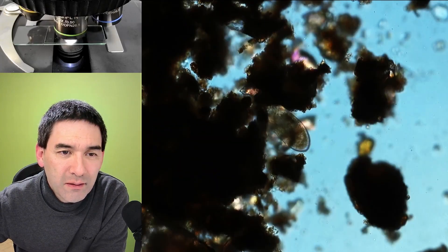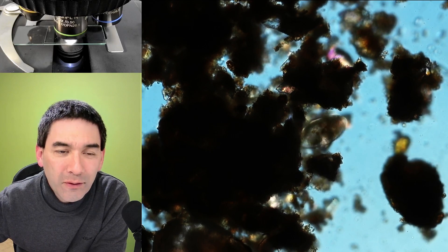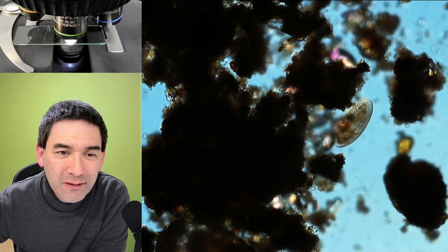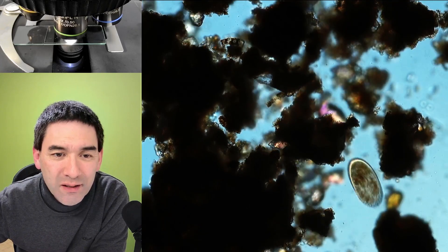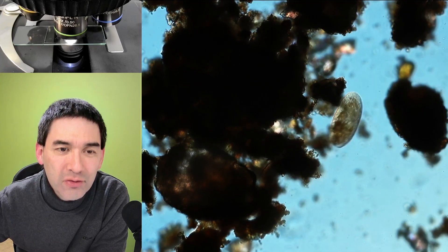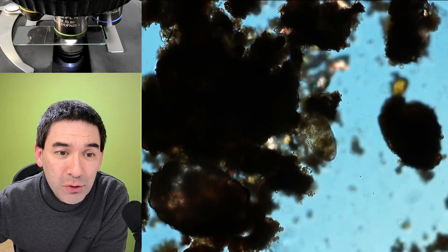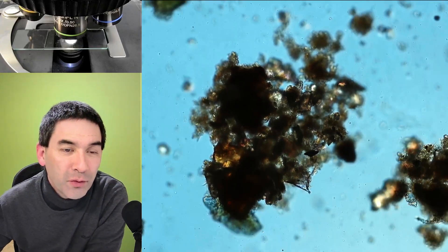Here we go again, now it's a little bit better. It's looking for food obviously and I can imagine that after a few days there are going to be yet more of these microorganisms visible as they start to reproduce because right now the sample is at room temperature.